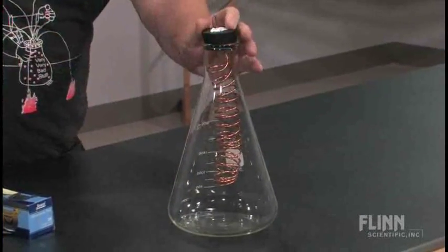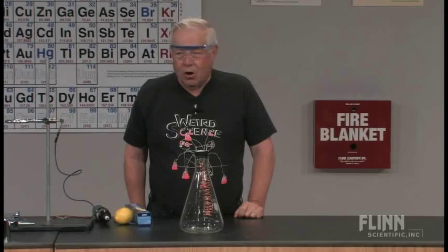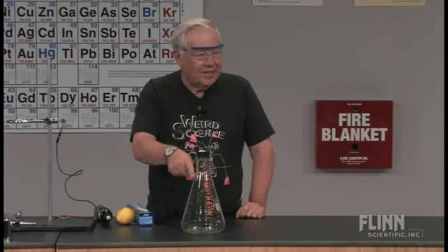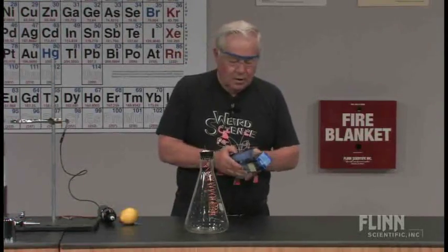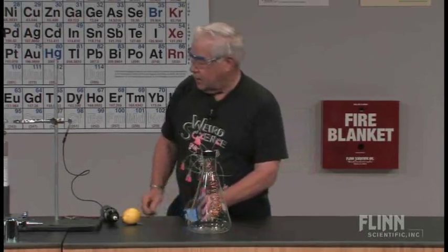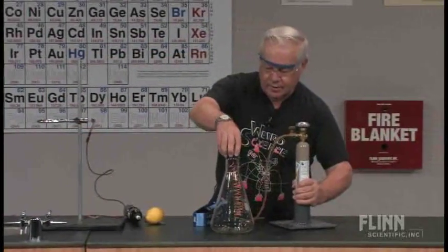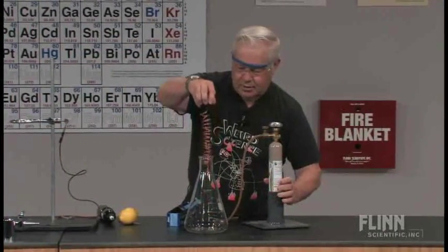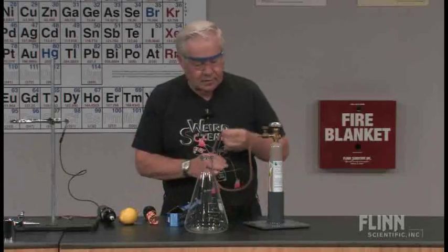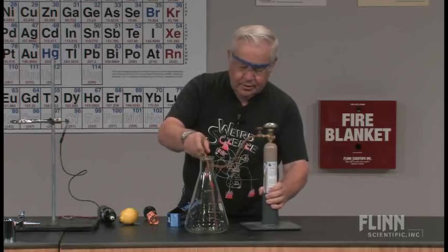Here is my coil, and what I want to do is generate some ozone inside this flask. To generate the ozone, I'm going to flush the flask first with oxygen. So we have an oxygen cylinder here and we're going to flush the flask with oxygen.